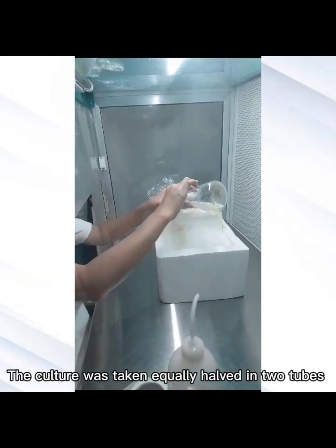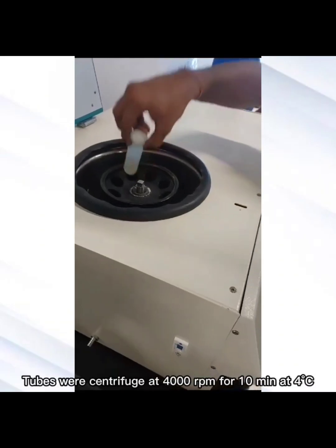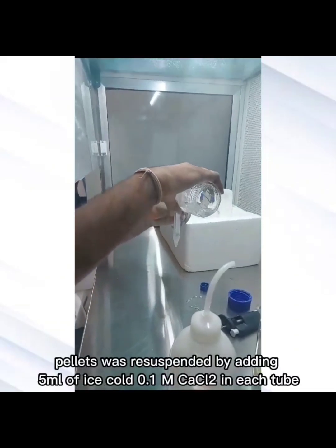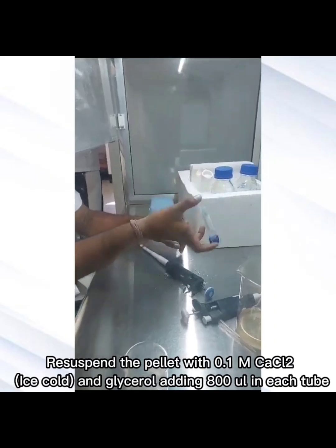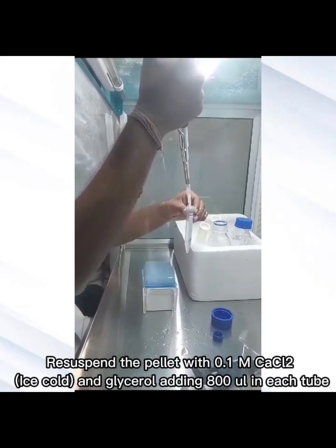First, take the culture in 2 tubes and centrifuge it at 4000 rpm for 10 minutes at 4 degrees Celsius. Then the pellets were resuspended by adding 5 ml of CaCl2. Again centrifuge at 4000 rpm. Resuspend the pellet with 0.1 molar CaCl2 and glycerol, adding 800 microliters in each tube.